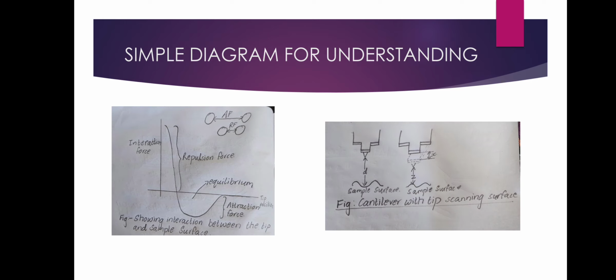In this image A, you can see that the distance between the tip and the flat region is, say, distance d, and the force between them is attraction force, as the distance is more. But as soon as this tip comes across the curved region, the distance between them gets shorter by x.